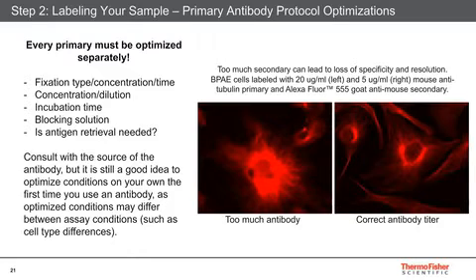I won't go into antigen retrieval much, but just realize that if there's a chance that your antigen binding site has been masked, for instance by your fixative, sometimes you can treat your samples with heat or pressure or certain buffer components to unmask those binding sites. There's a lot of different protocols out there for antigen retrieval and some good review papers. Most antibodies don't need it. And sometimes your commercial source will tell you.